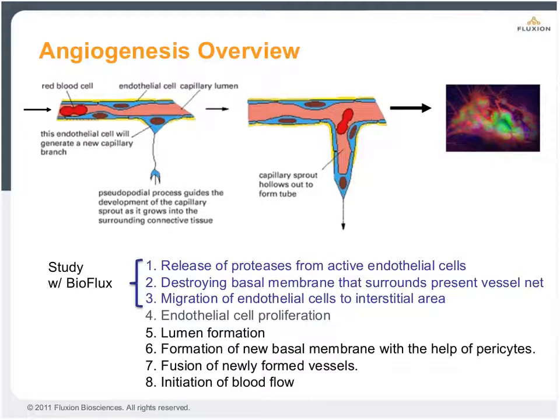Moving on from chemotaxis to invasion assays, so this is where we're using a solid in the channel versus two liquids. We'll talk about angiogenesis. Angiogenesis is a multi-step process that starts out relatively simply with a single cell, to be exact. What happens is a single cell gets a chemical message and then responds to that message by starting the process of angiogenesis. And in the case of cancer biology, this contributes to the vascularization of tumors.